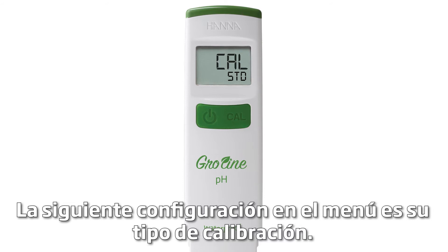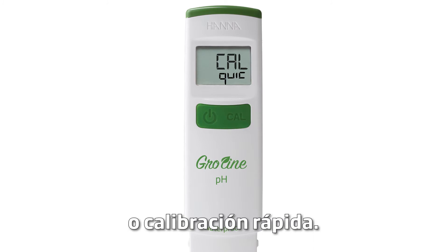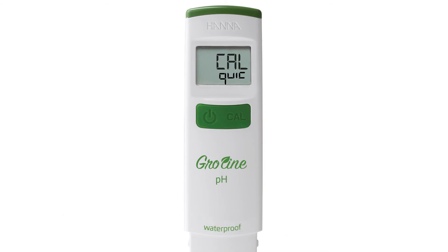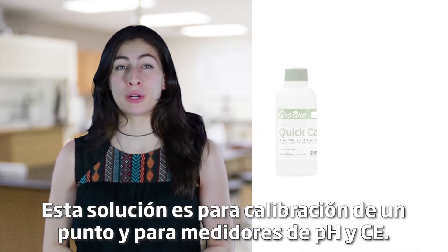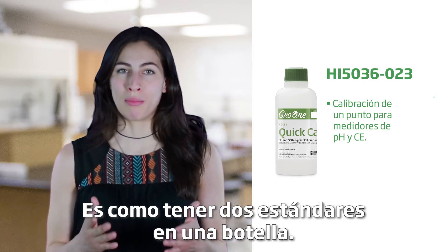The next setting in the menu is your Calibration Type. By pressing the Cal button, you can choose between Cal Standard or Cal Quick. The Cal Quick setting lets you use the Growline Quick Cal Calibration Solution. This solution is for a one-point calibration in both pH and EC meters — it's like having two buffers in one bottle.